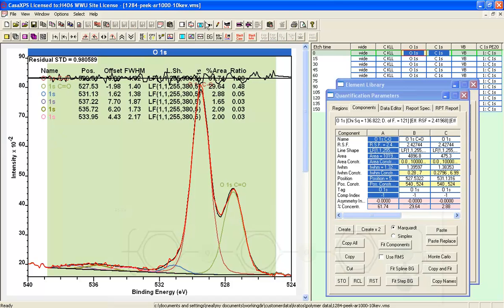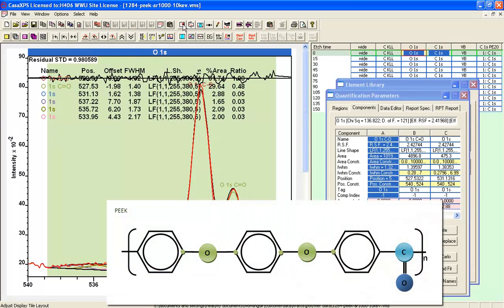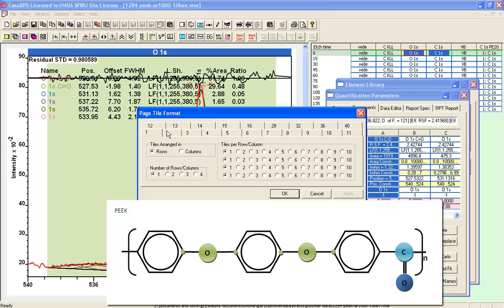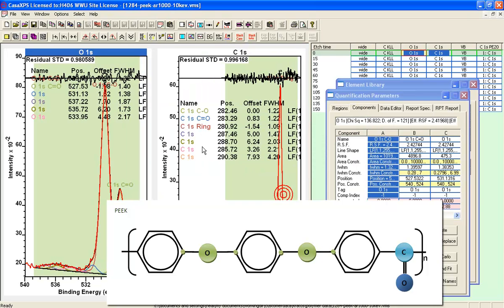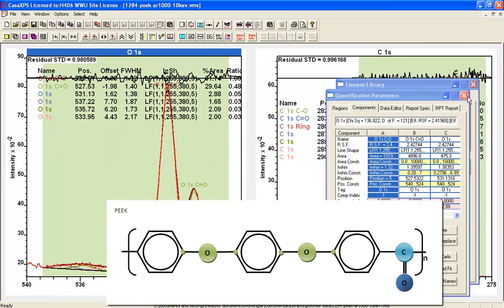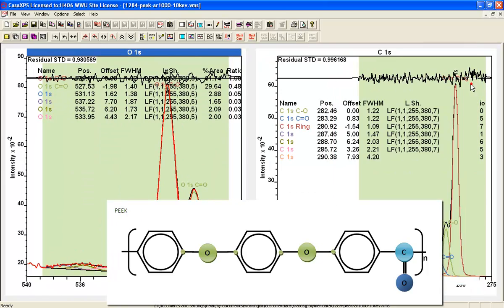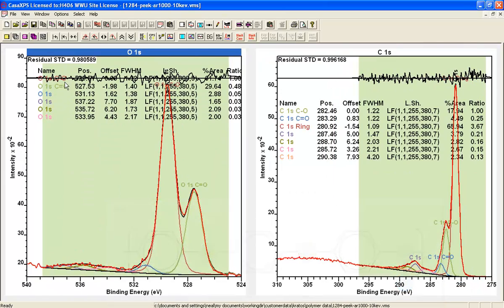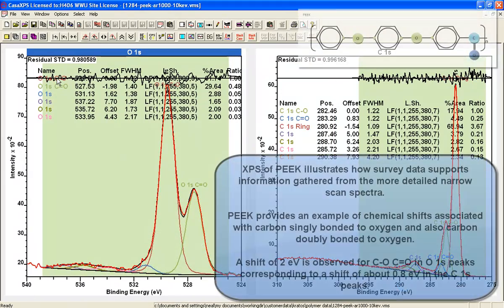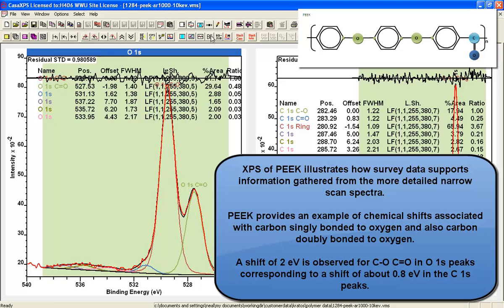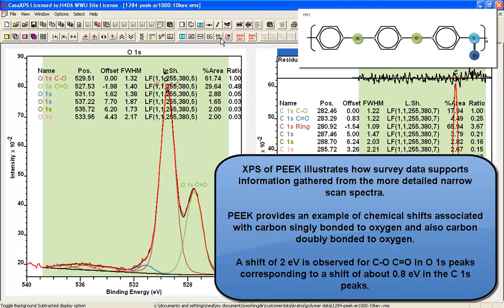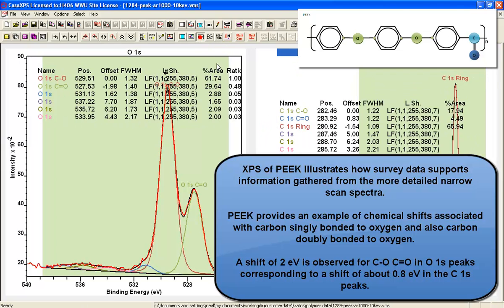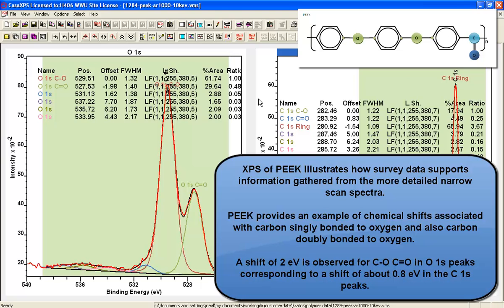Now if we look at these two spectra together, the oxygen and the carbon, you can clearly see how PEEK gives us some valuable information in terms of chemical shifts. It also shows us that the offset of the doubly bonded to the singly bonded oxygen peak is about two.